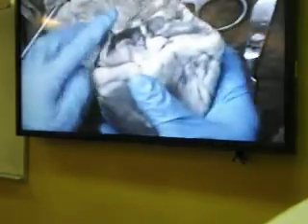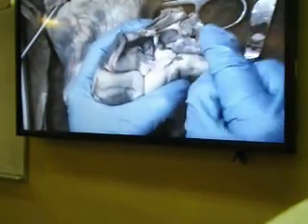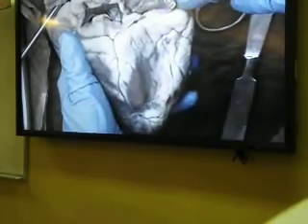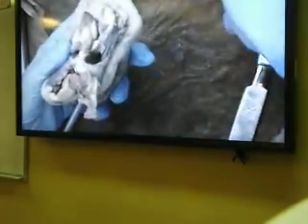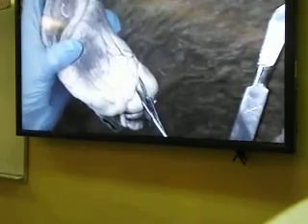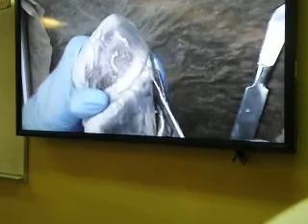Okay, so if you did not have the superior vena cava, inferior vena cava very well, that is almost already cut off, your cut should just start with the right atrium, through the right atrium on the side of the heart to the apex. For those of you who saw the superior vena cava, you already have it here. Coming to the posterior aspect, you start your first cut. Be careful, lot of fat there. There are chances if you are not careful you can have an accident.